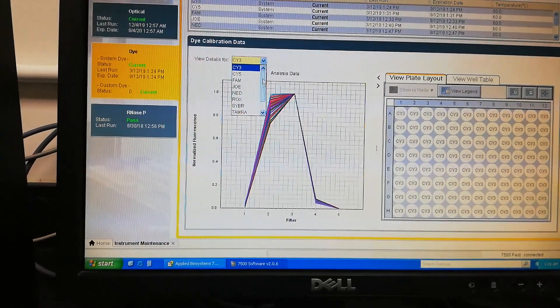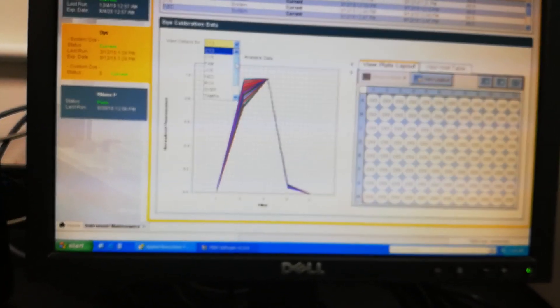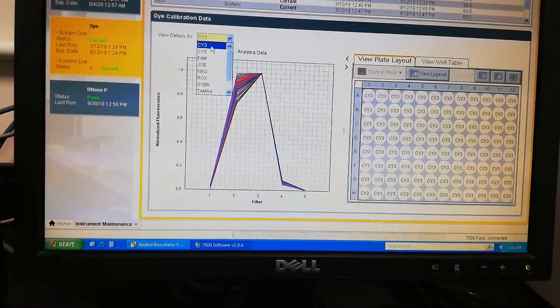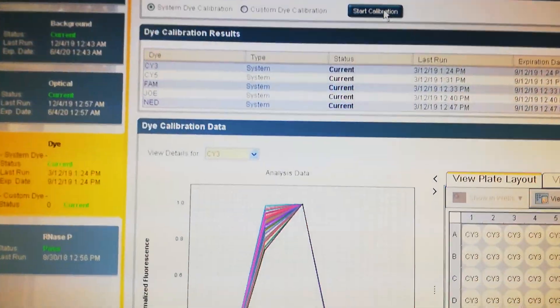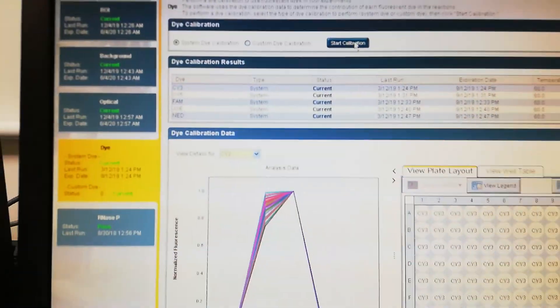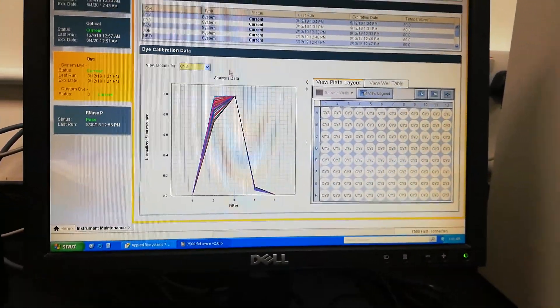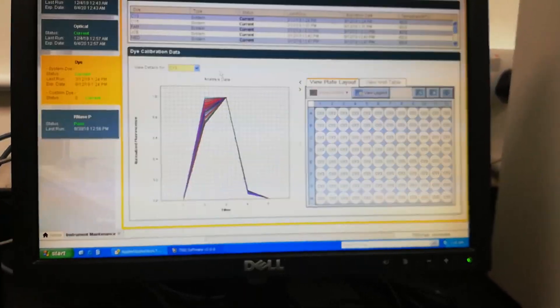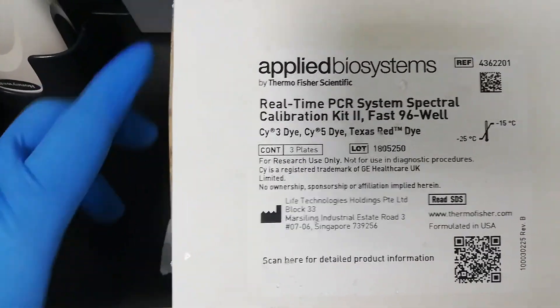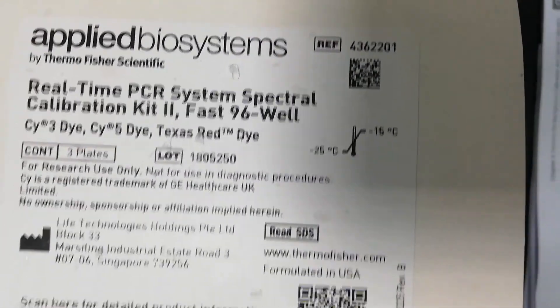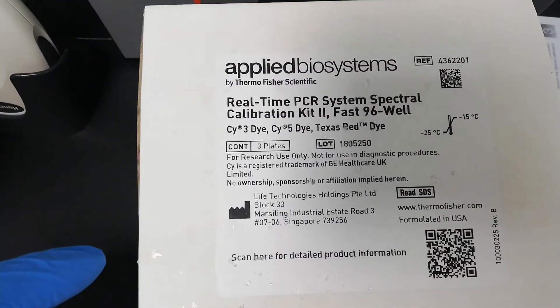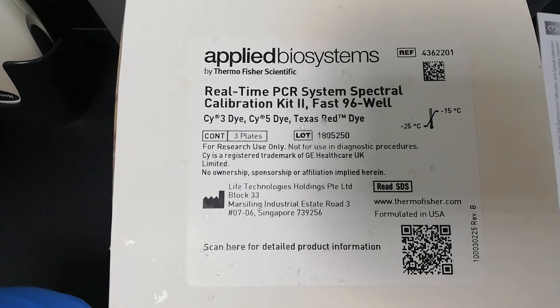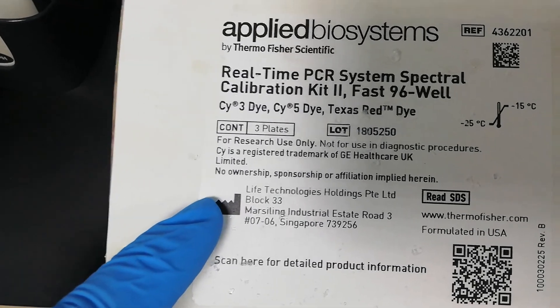Normally in this calibration kit, different plates for different dyes come, and we can select each dye. For each dye we have an individual plate. I will just select this CY3 dye. By pressing this calibration button, this calibration will start. This is the kit from Applied Biosystems with catalog number 4362201.